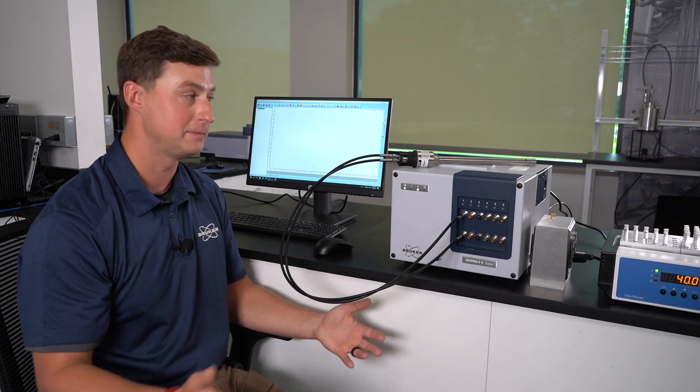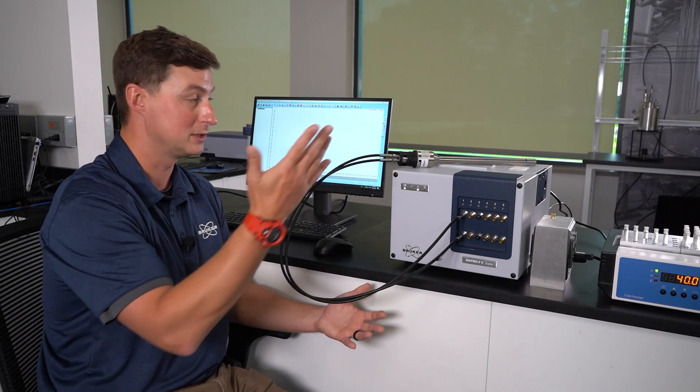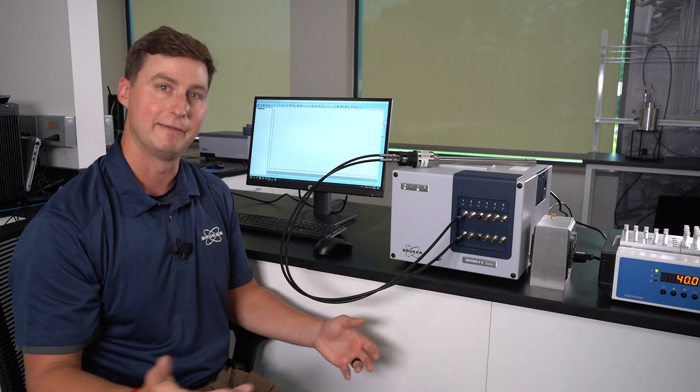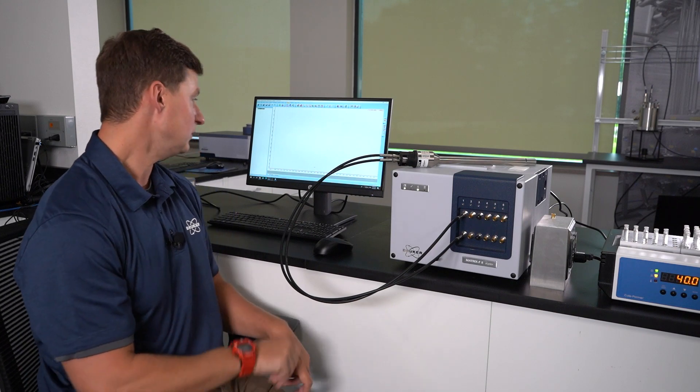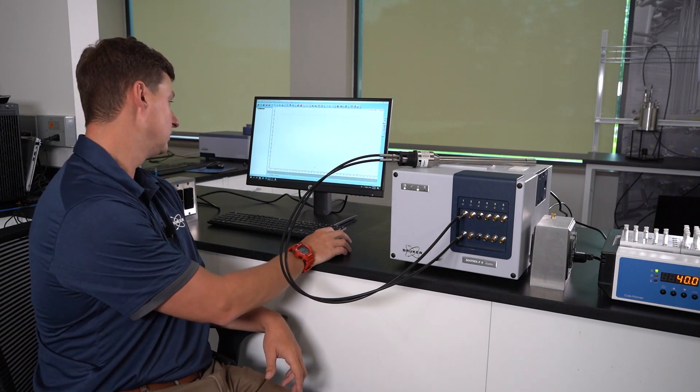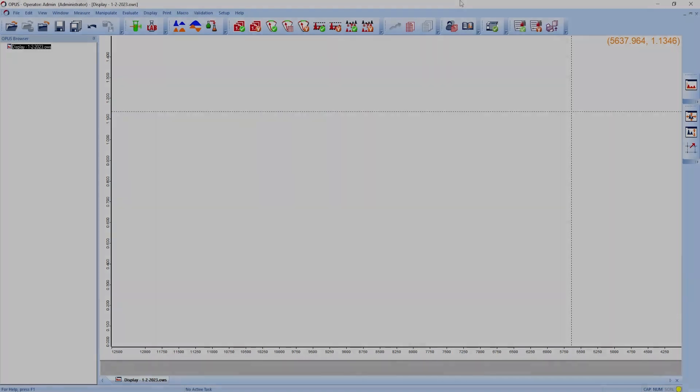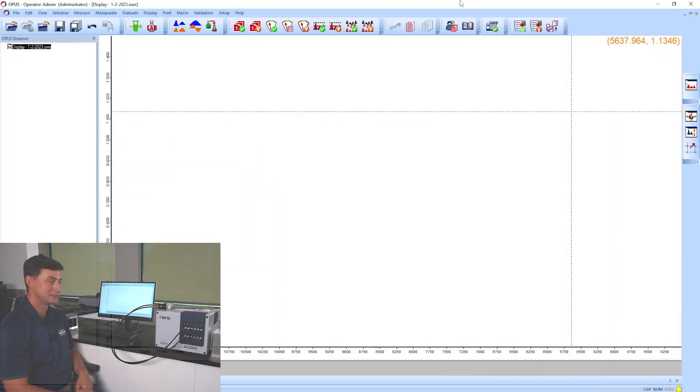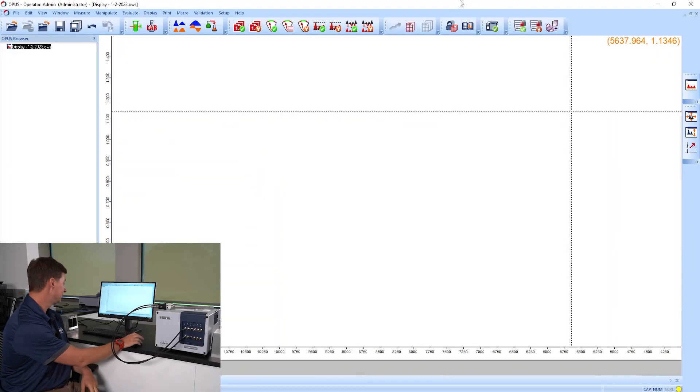I've prepared those six samples, we've scanned them with the process analyzer, and I have the reference data for that. So now we are going to build this calibration and show you what that looks like.